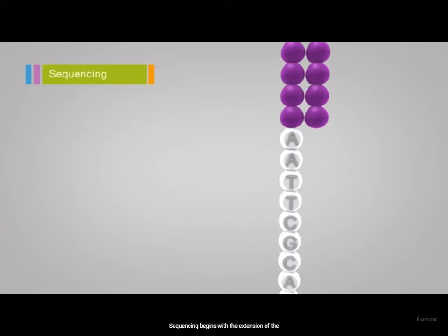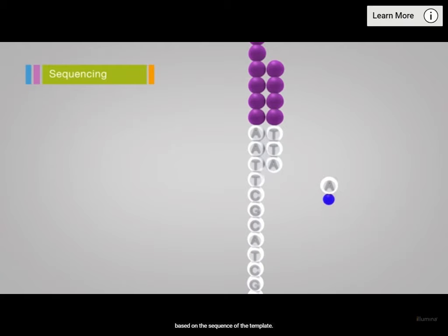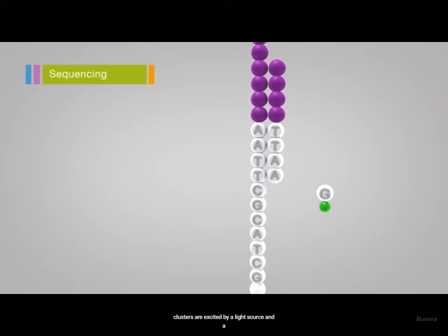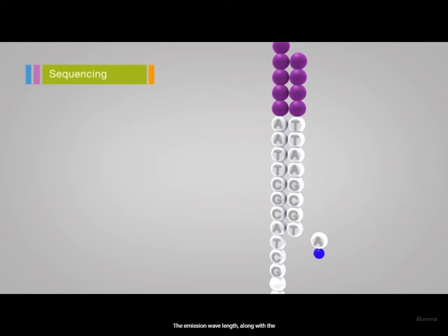And as each one arrives, you see that little flash of light that showed? Where the blob turned white? Yeah, that flash of light is what we're capturing on our photo cell. Those flashes of light, which nucleotides produce light at a particular site, give us our readout sequence for that location. We had a green flash, so there's a G there. We have a red flash, so there's a T at the next position, and so on.